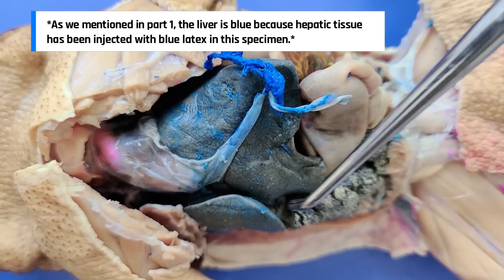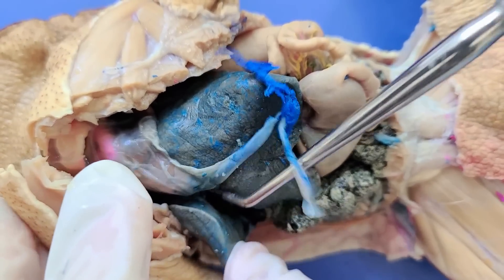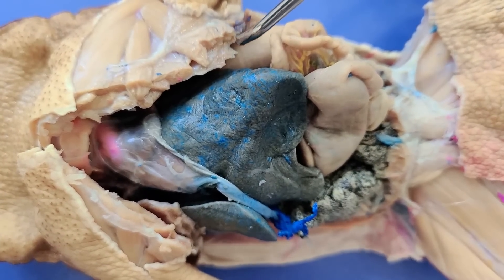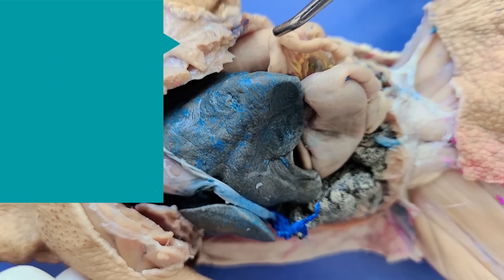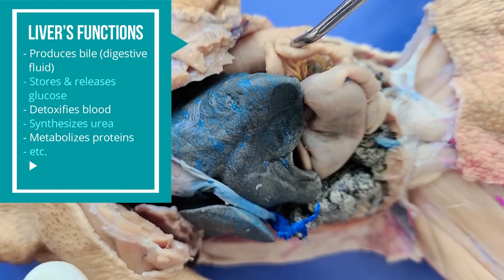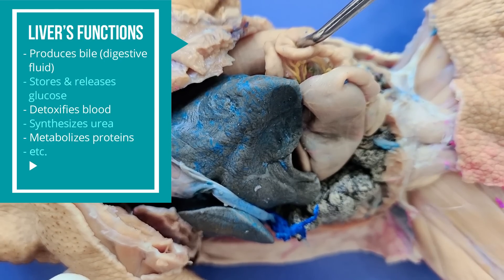The liver has three lobes — one lobe here, another lobe here, and a third lobe here. It's the largest organ in the toad's body. The liver is the ultimate multi-tasker: it produces bile, stores and releases glucose, detoxifies blood, and more.